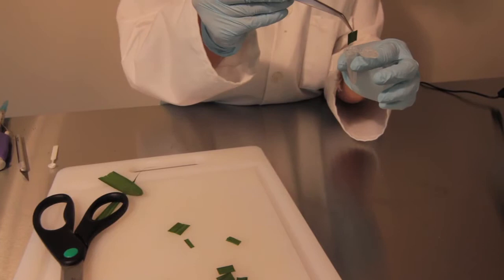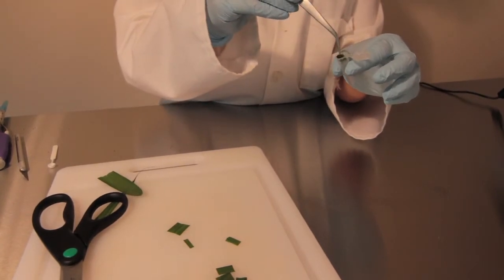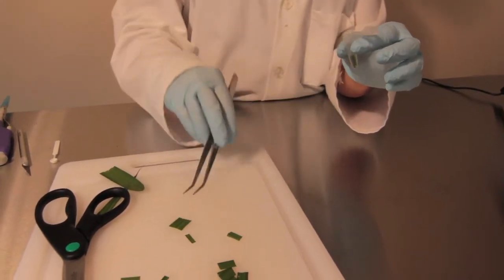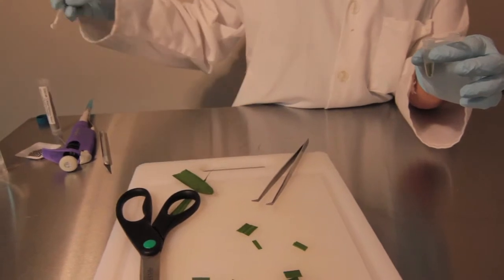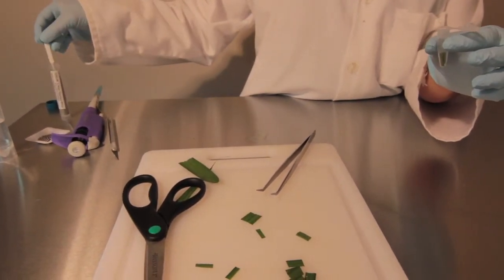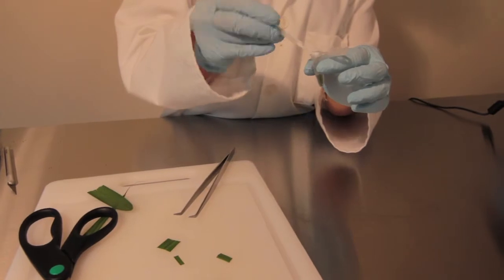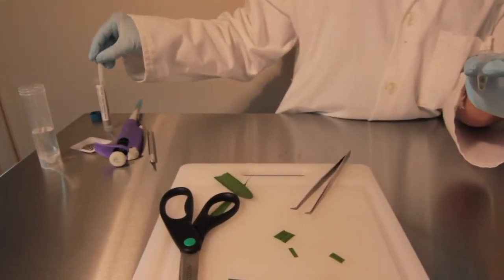When loading your samples into the tube, make sure that you don't stuff them into the bottom, or else the sample may get jammed in there and prevent proper homogenization. Instead, gently push your sample in and make sure it's not pressed up against the side of the tube.